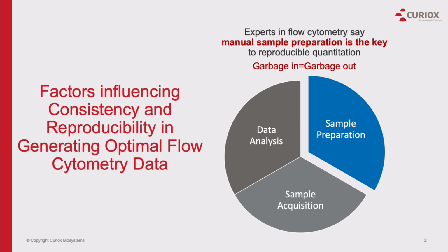And it's in this sample prep pie, the blue pie, that many experts in the flow field, including myself, say that manual sample prep is the key to reproducible quantitation, and that there can be issues that can arise with manual sample prep. A long-time friend of mine whom I've admired, Dr. Howard Shapiro, who many of you know in the flow community, originally termed it garbage in, garbage out, and I love that term.